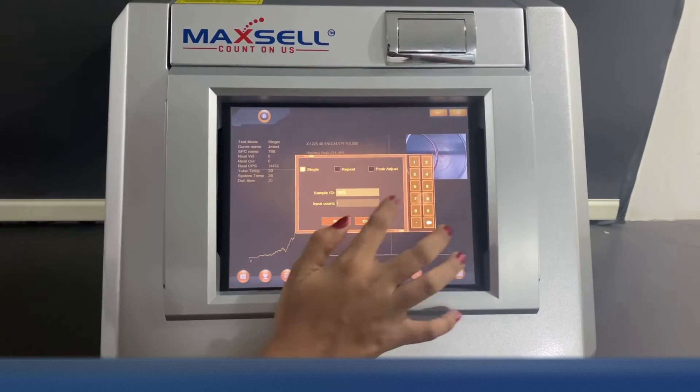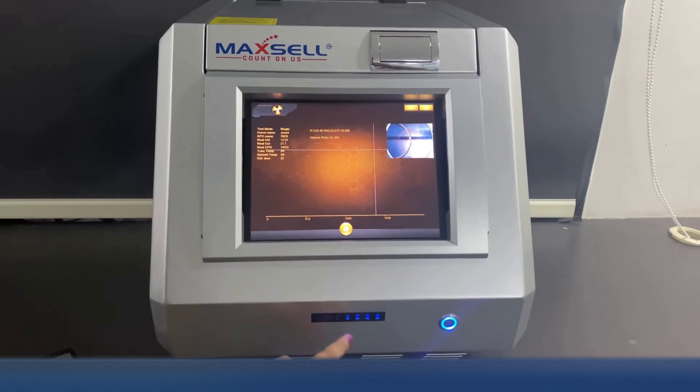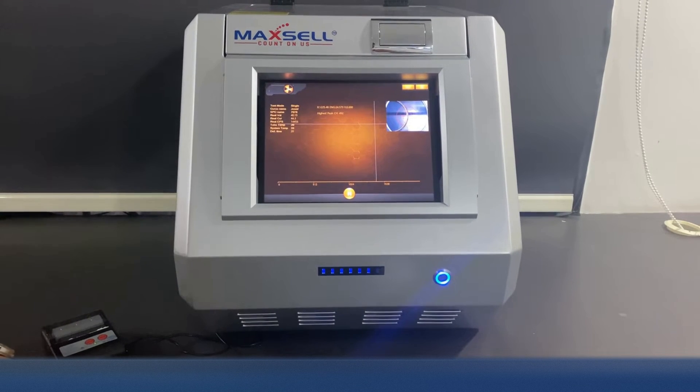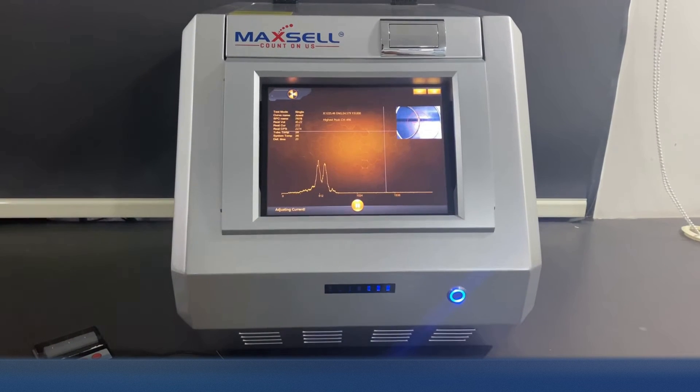To start the process, we click on the Jewel Comm software and complete all the steps, filling in all the details. The blue indicator LED lets you know that the process has started. The curve on the screen also shows the progress of testing.